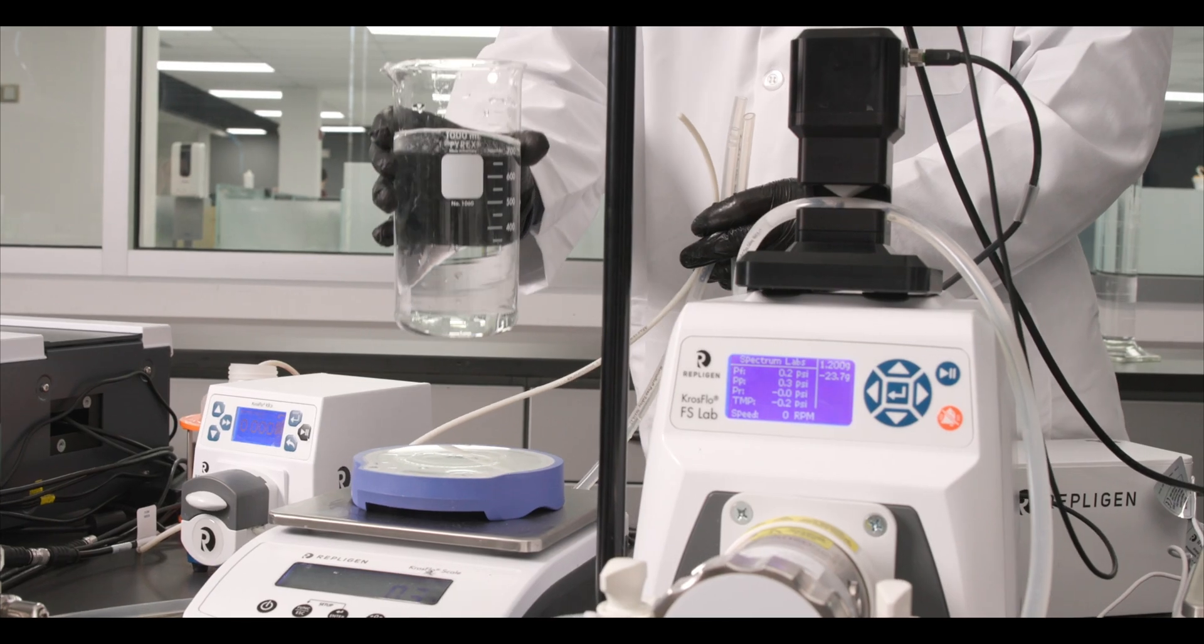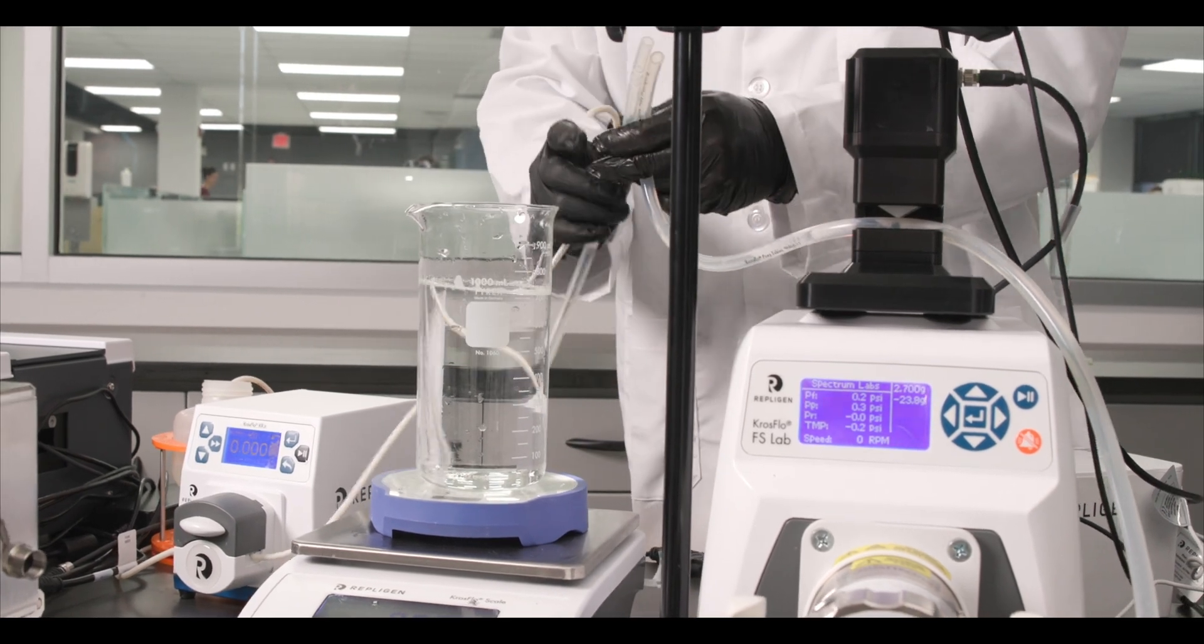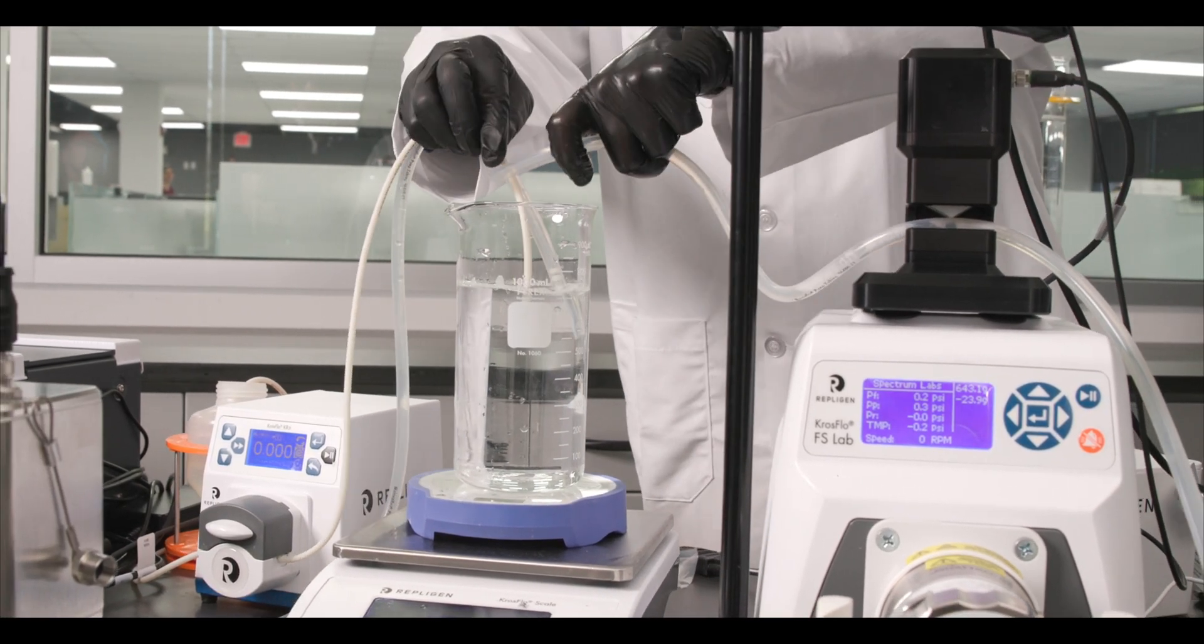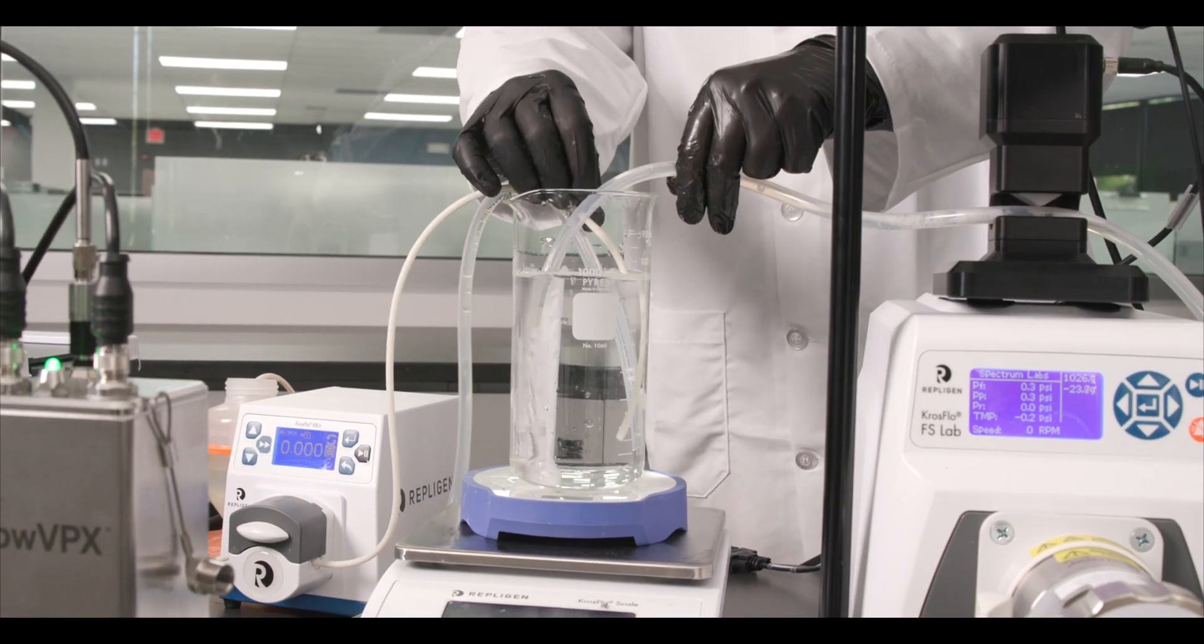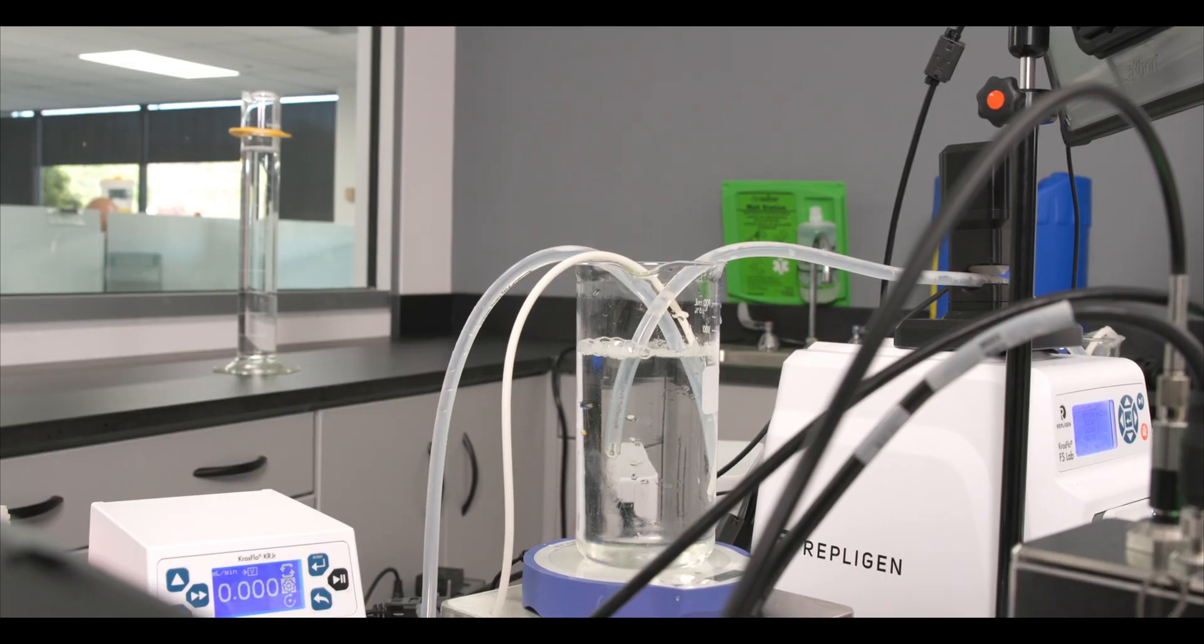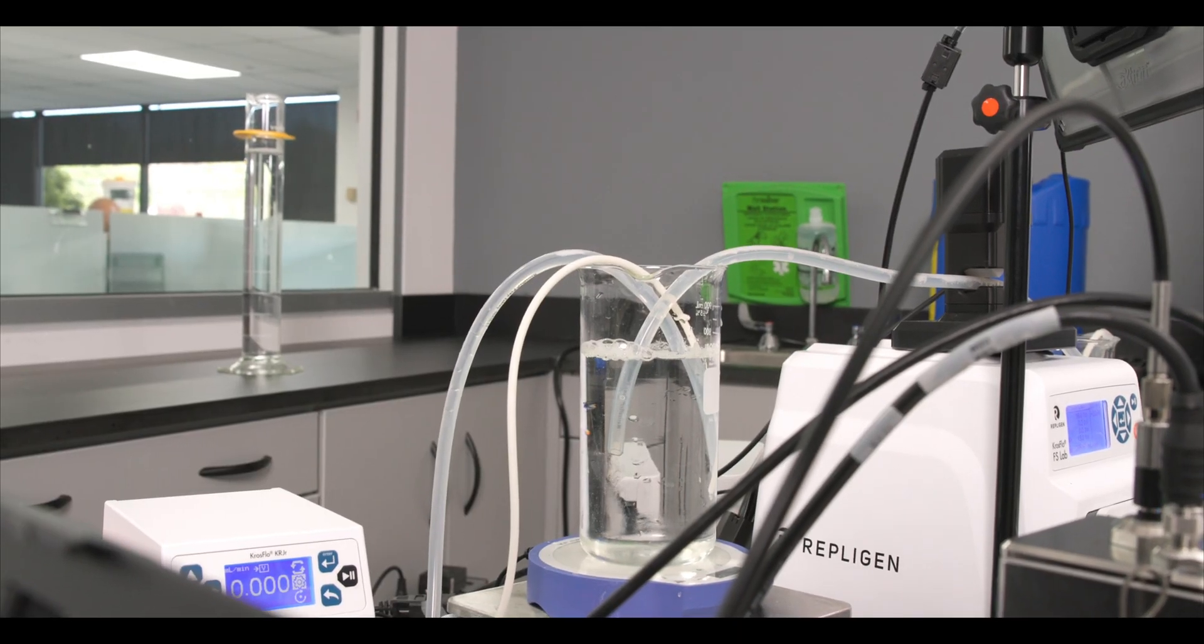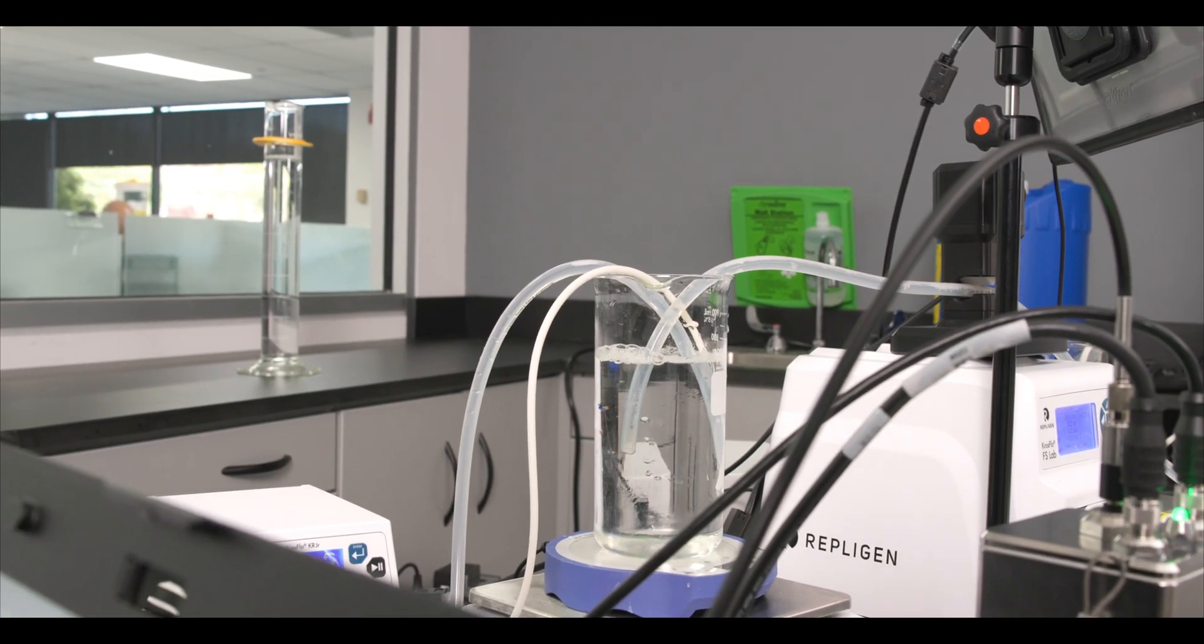And once the flush is successfully completed we clean out the system with a 30-minute flush using 0.5 molar sodium hydroxide. Then flush the system with water and leave dry.